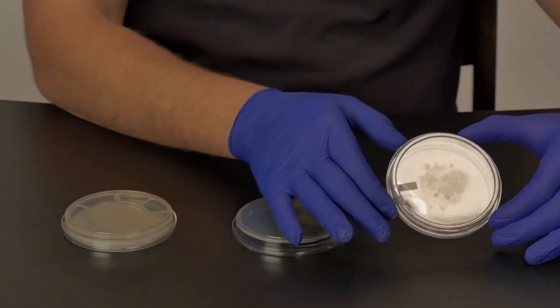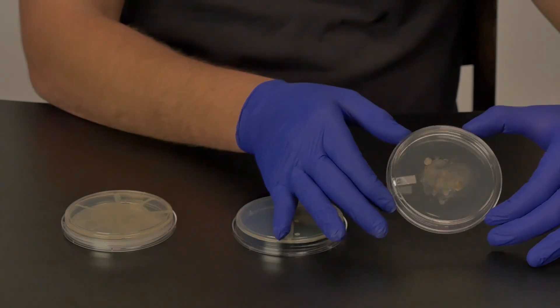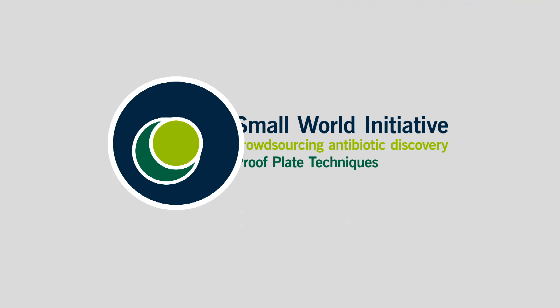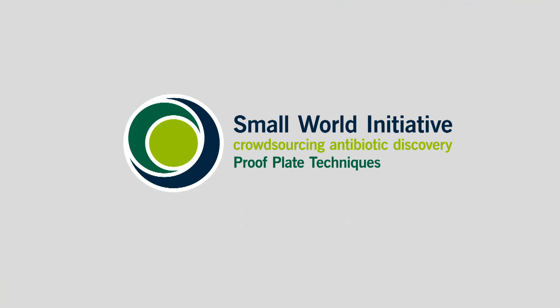You have successfully proven that your soil bacterial isolate produced an antimicrobial compound because of the zone of inhibition you saw around the escape pathogen. In science, we replicate our results in order to confirm that we really saw what we thought we saw. The next step is for us to confirm these positive results. We call this proof plating.